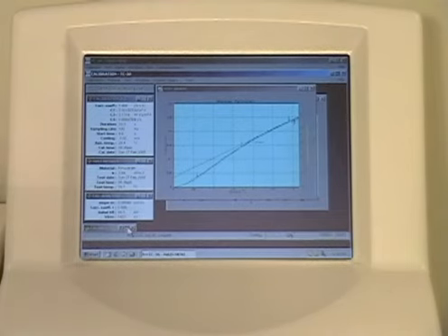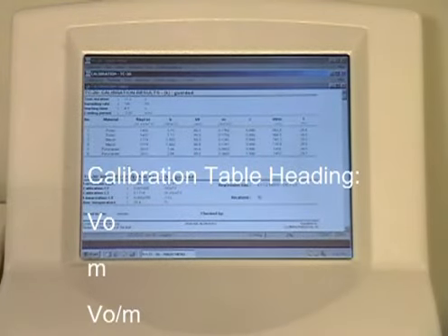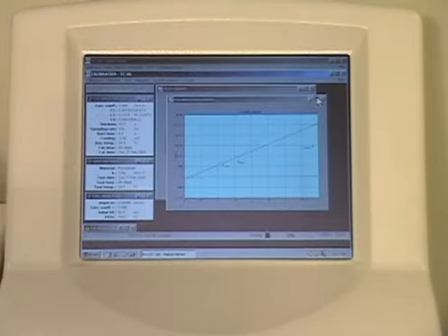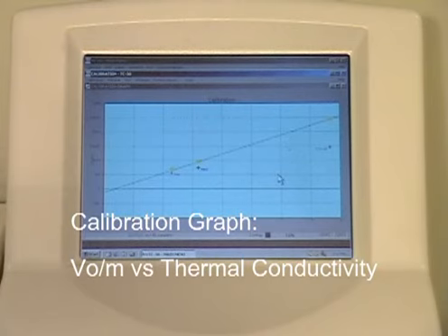The three most important columns of your completed calibration table are VO, which is the initial voltage of the heating wire before each test begins, and M, the slope of the area of the line between the start time and the total test time of your chosen parameters. The calibration graph displays the calibration line of V over M versus the thermal conductivity of each reference material selected.